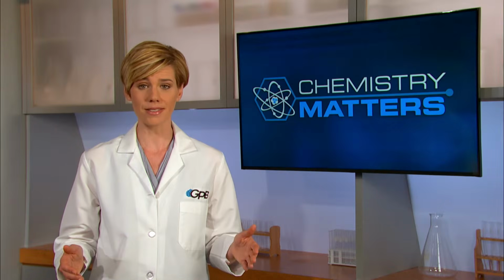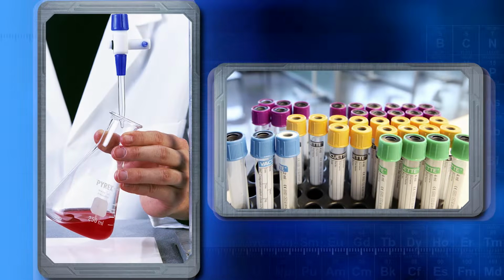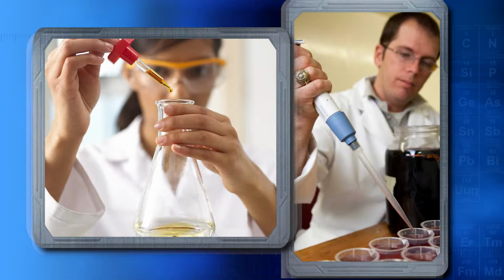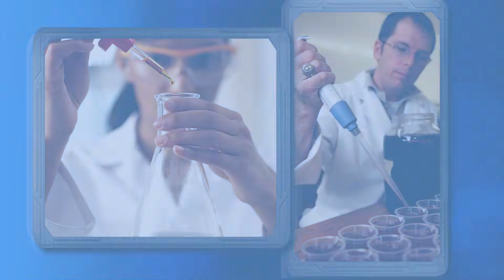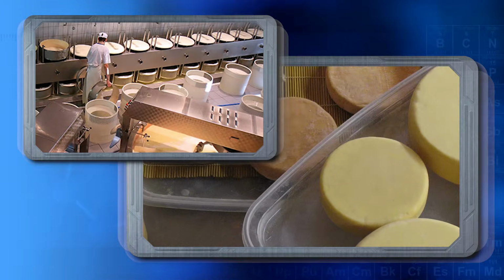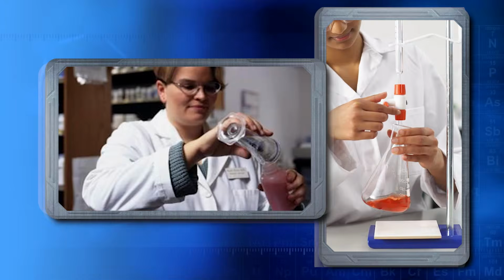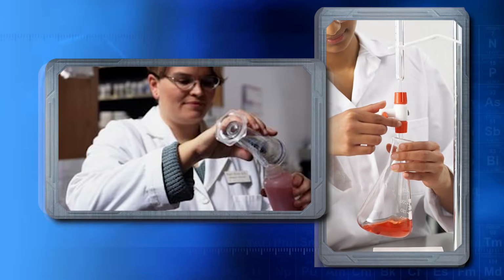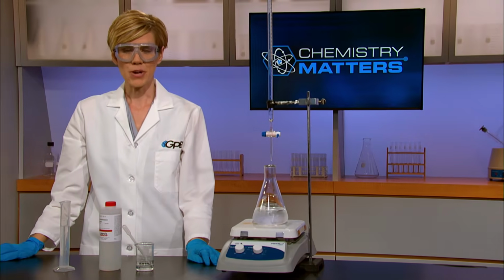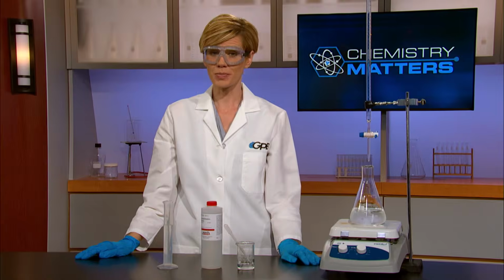Lots of people depend on the information gained by titration analysis every day. For example, titration can be used by hospitals to determine the concentration of chemicals in blood or urine. Titration is often the way we figure out the fat content or water content or the concentration of vitamins in food. Titration is the best method to determine if cheese has the right flavor chemical concentration before being distributed to grocery stores. And as you might expect, titration is necessary during the very precise manufacturing processes needed to produce medications of the proper dosage. Titration experiments can be run with acids and bases. Keep in mind that titration is tricky and requires patience.